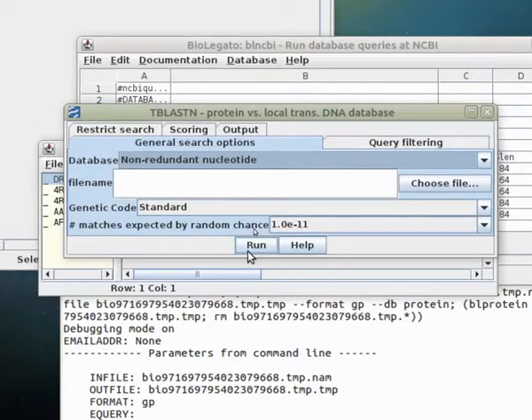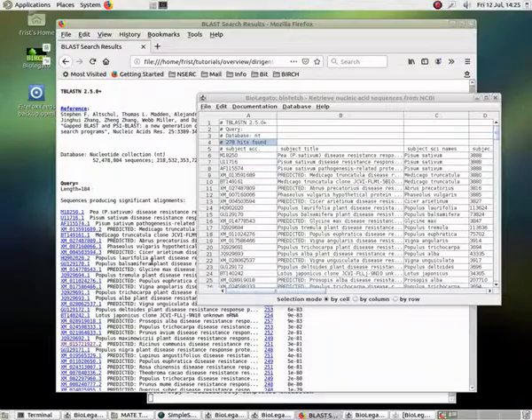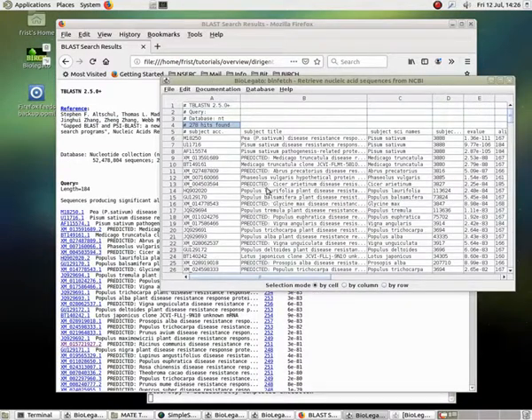And I'm going to edit out the time it takes to actually run the program, and then we'll come back when that's completed. So now we have our results back in two windows. One, you can see the usual web page with the BLAST output that lets us take a look at just about any of the hits, and then very conveniently a table of the same hits with all of the same information but in table form. And you can see there are 278 hits.